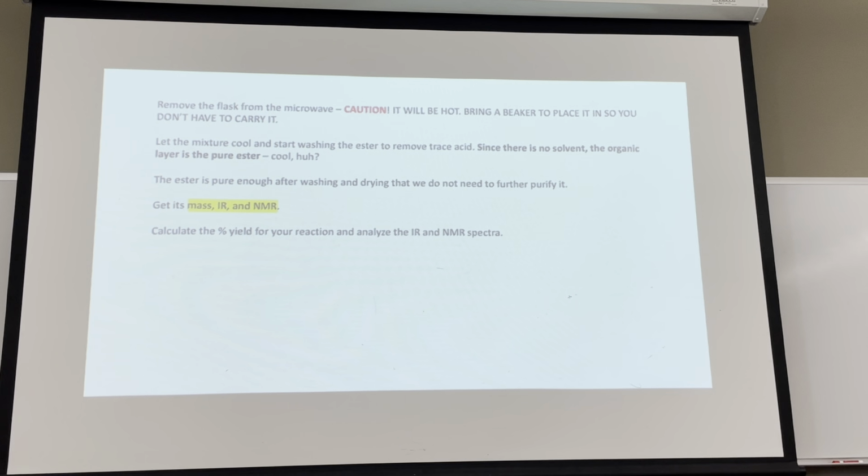Are we doing boiling point when we're characterizing? No, don't worry about the boiling point. In terms of characterization, you're only going to get the yield as always, IR and NMR.